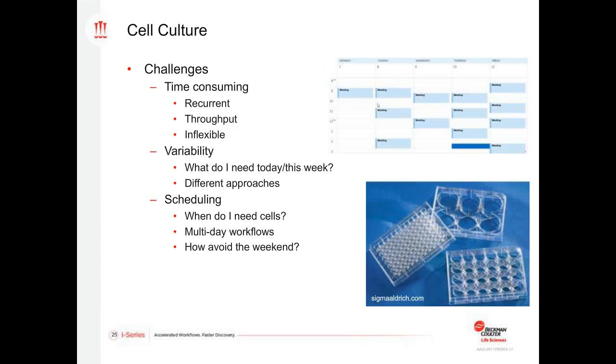And finally, it comes down to scheduling as well. When do I need cells? When am I going to plate my experiments? When I'm doing multi-day workflows, frequently, again, some of these cell culture assays may take days to weeks. What planning ahead do I need to do to ensure that I'm not here all day on a weekend? And so these are just some of the considerations that can hopefully be addressed through automation.